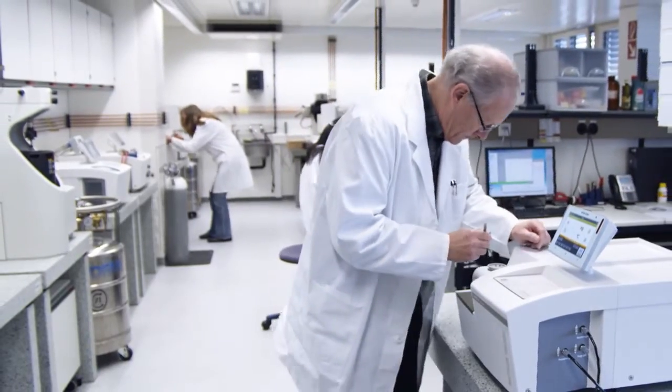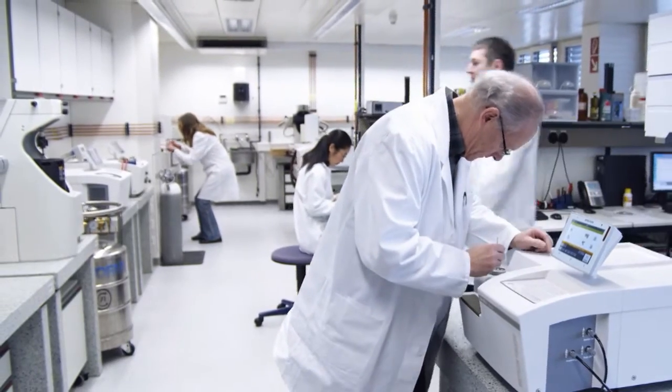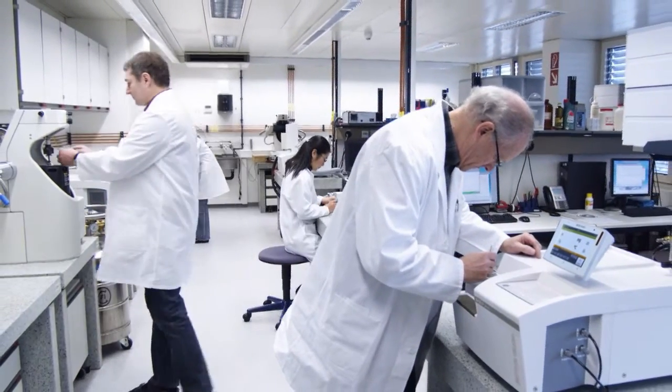The thermal analysis excellence instruments allow you to characterize materials over a wide temperature range.